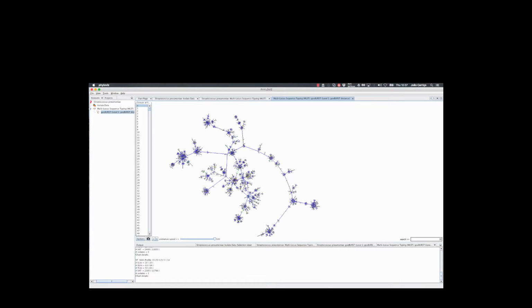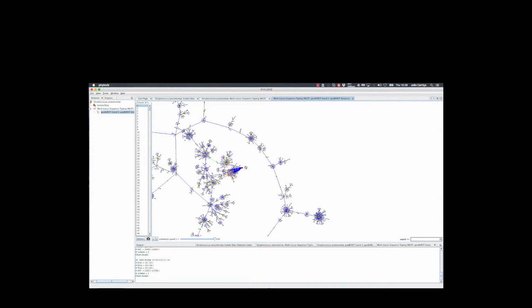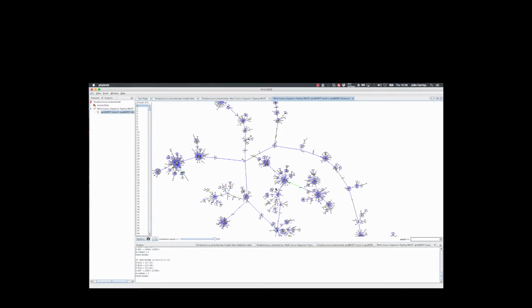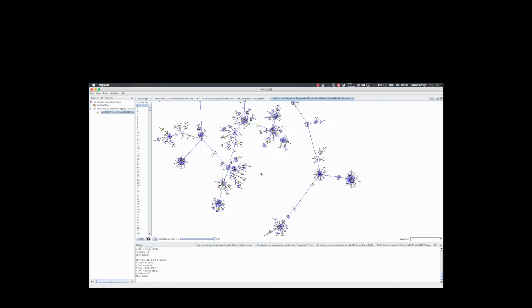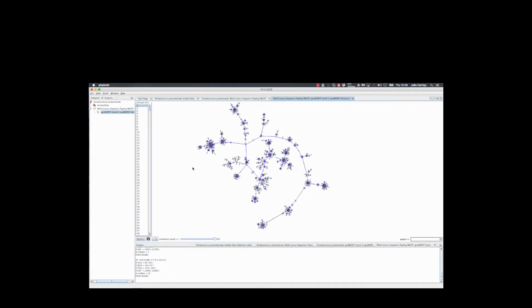We are almost there. With trees of this size, it's always tricky to display them correctly. Hence, the force-directed layout that we use in PHYLOViZ helps a bit in doing so. And you can actually orient, adjust the tree to your taste. Okay, this is it. As you can see, you have the whole tree now completely untangled.